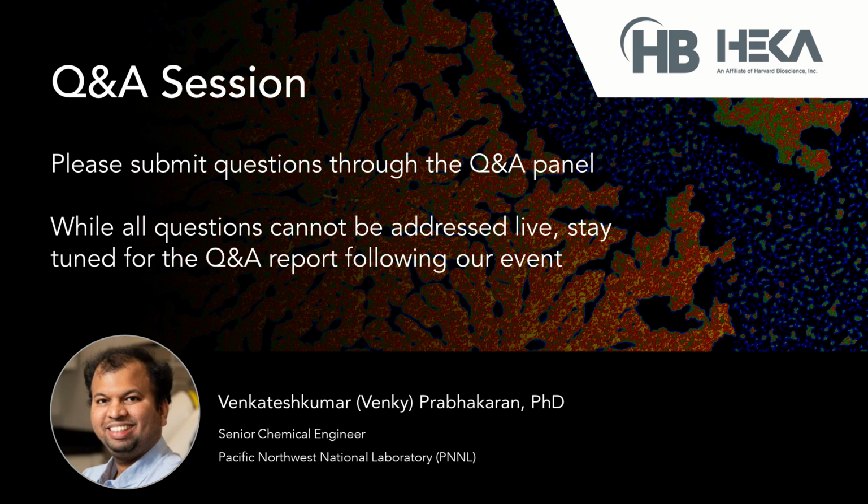It's an excellent question, and it's one of the questions we, as a community, always ask. Generally, no. To the best of my knowledge, no one has tried to use SECCM at high temperature. However, it is possible to do high temperature if you are working with an electrolyte that does not evaporate at that temperature. I believe in aqueous electrolyte, it's not quite possible because you typically have a high evaporation rate.